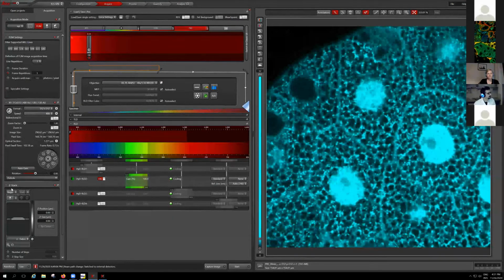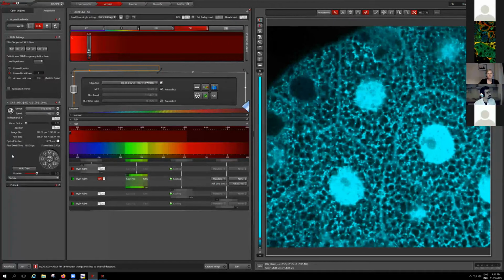Then down here, the SAC, we don't mind about that. Another thing is that we would like to do NADH and FAD in 1 sample. There is a publication by Angelika Rück and Wolfgang Becker, the Wolfgang that Mr. Becker talked about 2 days ago, regarding simultaneous imaging of FAD and NADH in the sample using a dual beam infrared laser.